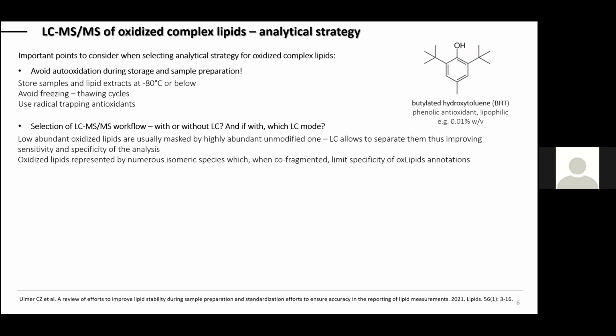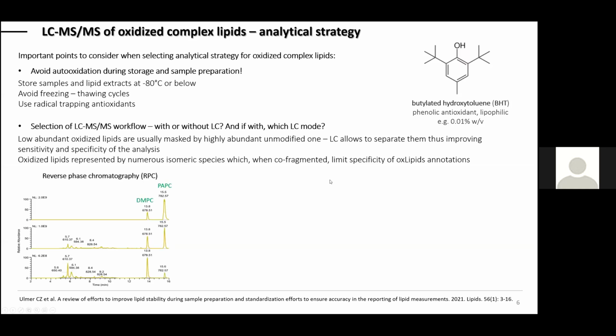Moreover, these oxidized lipids are represented by a really huge number of isomeric species. And if they are co-fragmented in our tandem mass spectrometry experiment, that limits our specificity of identification. So we strongly rely here on separation by reverse phase chromatography before mass spectrometry detection.